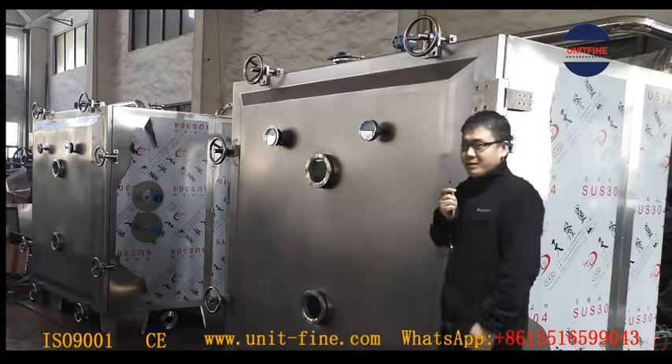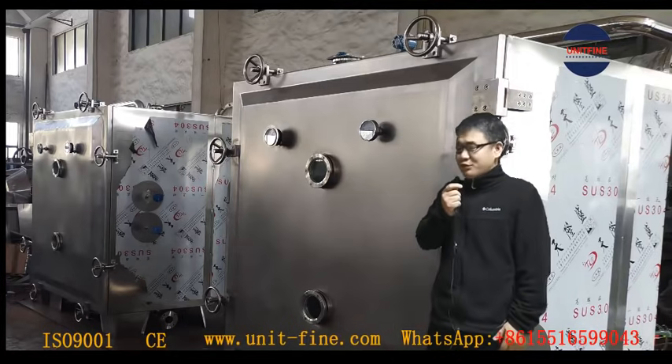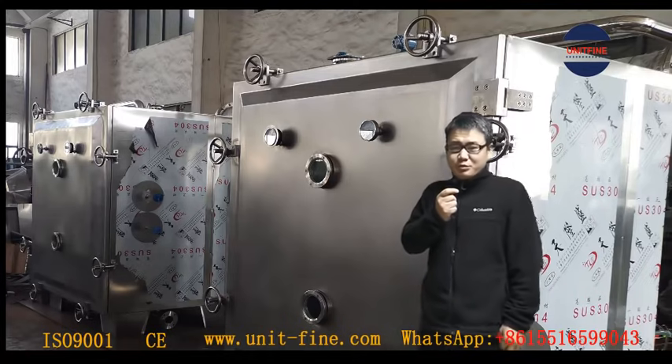The two machines behind me are vacuum tray dryers. Now they are ready to ship. Before the shipping, we have done the trial assembly in advance to show our customer.